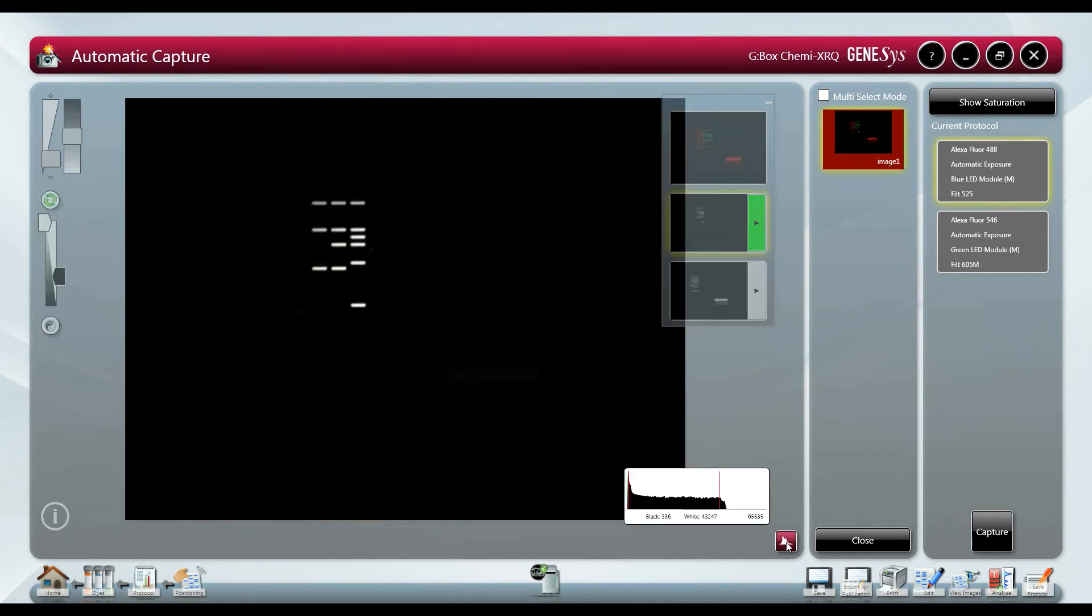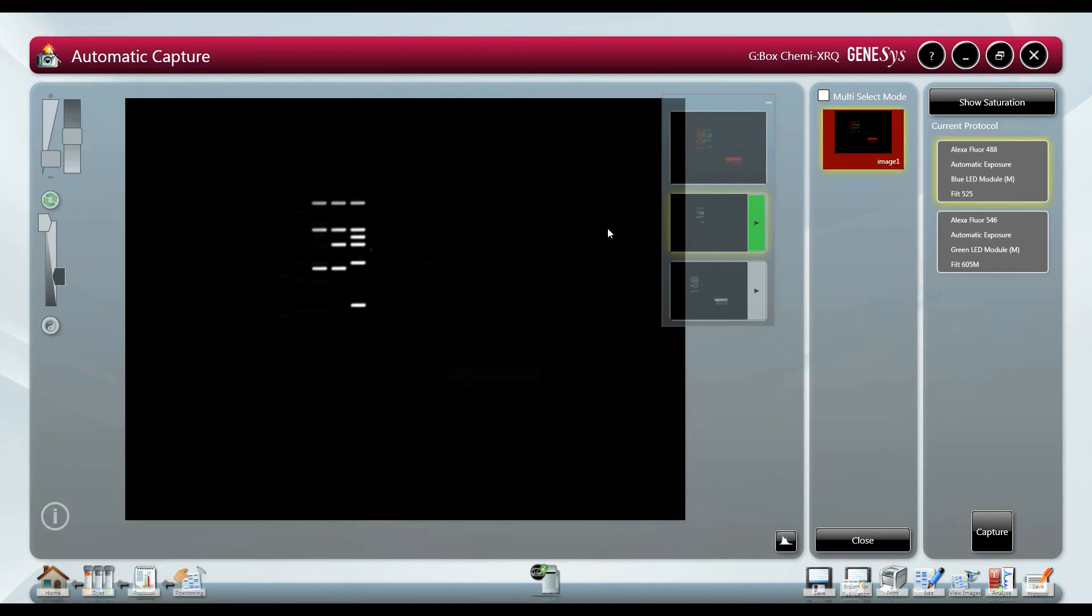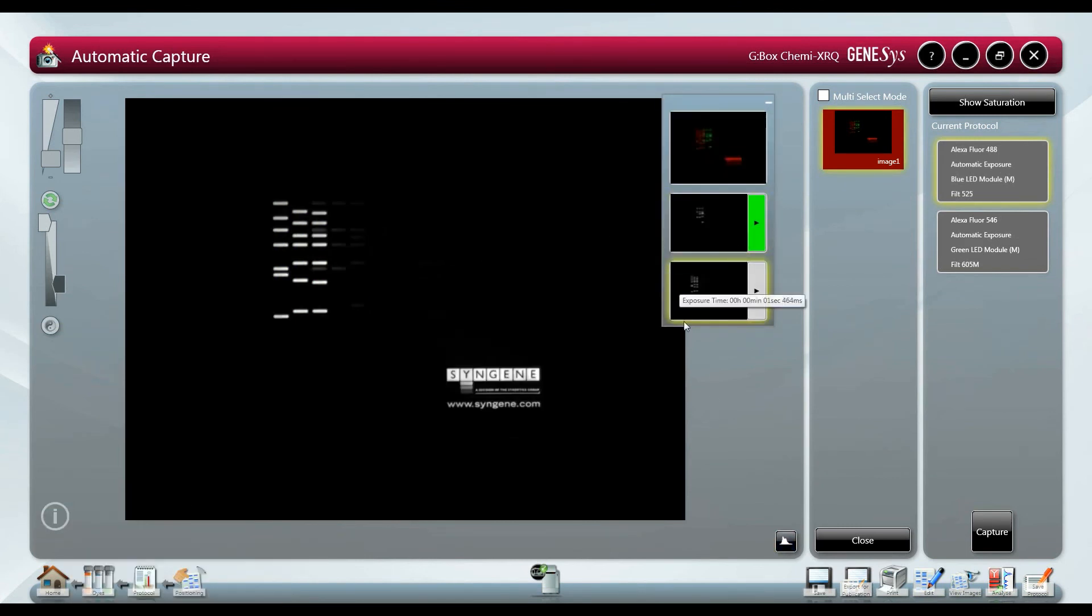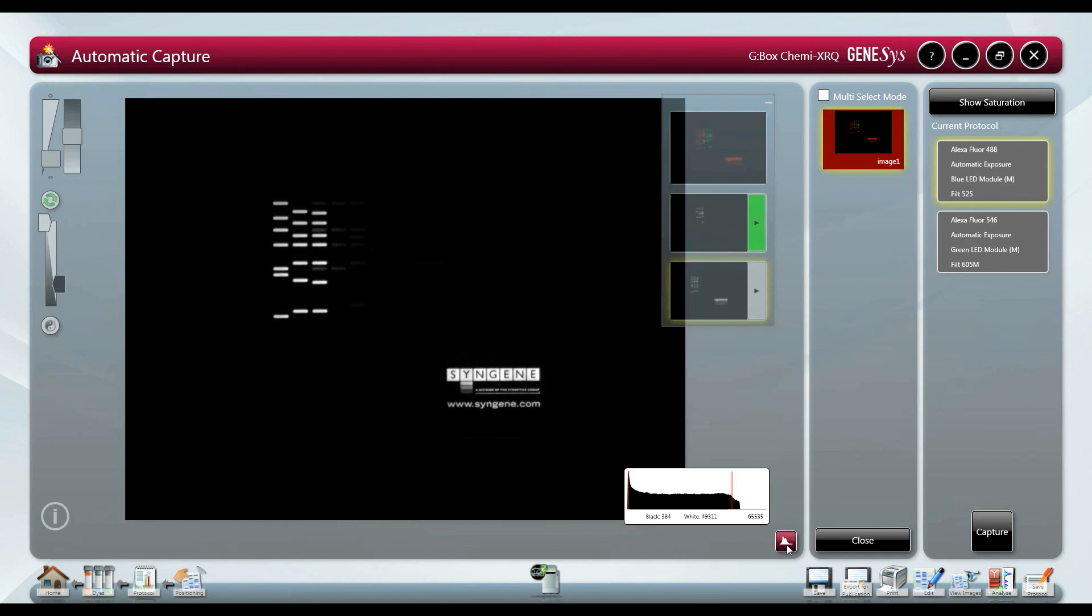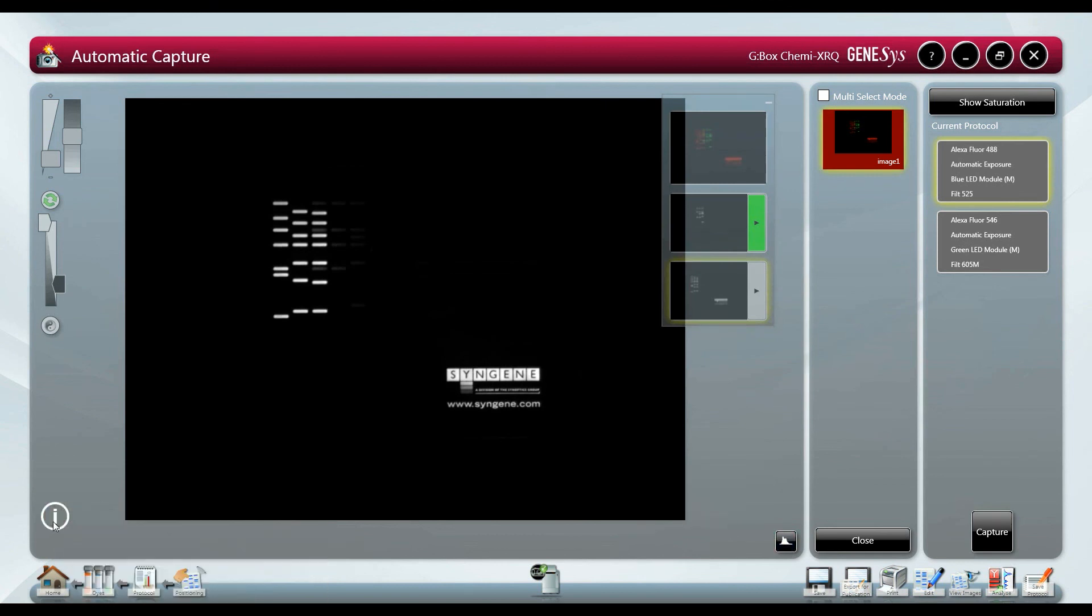The histogram shows the level of gray scales used in the 16-bit camera. Band colors can be edited for user preference and annotations to the image and direct export to gene tools for quick and simple quantification of the blot can also be performed.